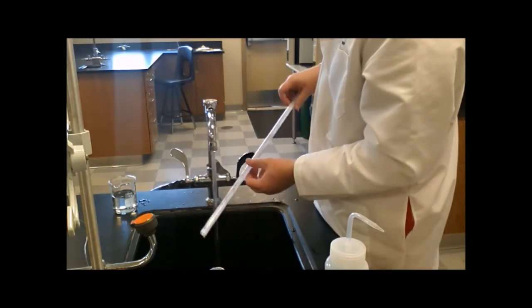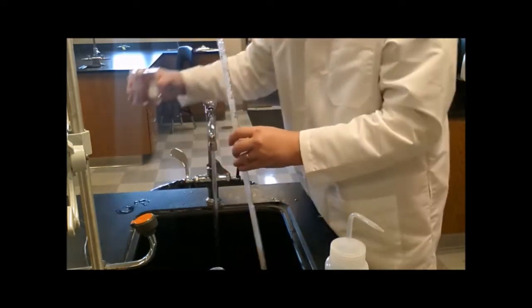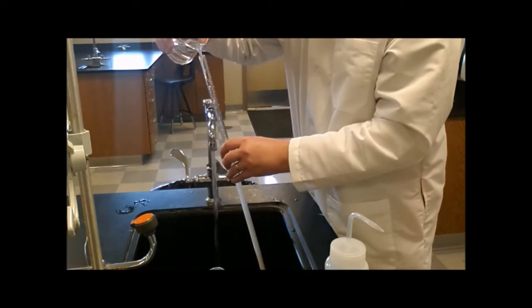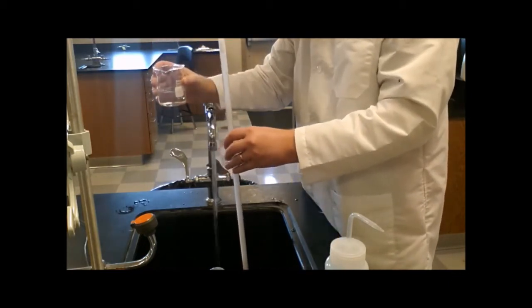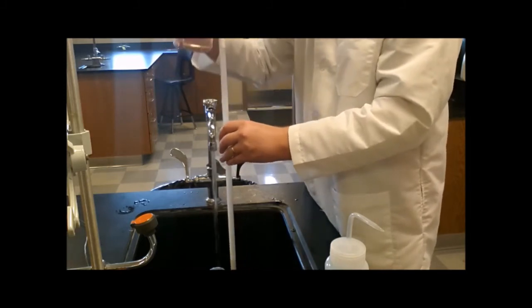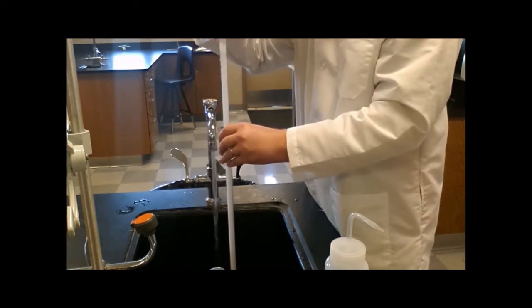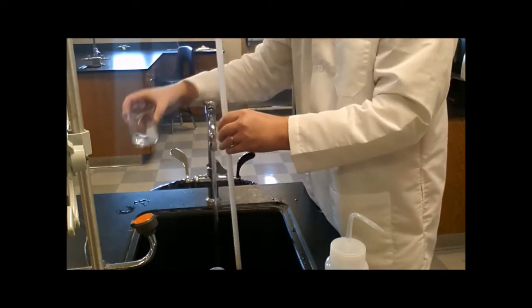But all of that sudsy, soapy stuff is still in there. So what you can do, and this works for any glassware, is fill it up, and keep filling it up so that it overflows, and continue to overflow it. All of those bubbles will rise to the top, the suds will overflow out the top, and you won't have to worry about them.